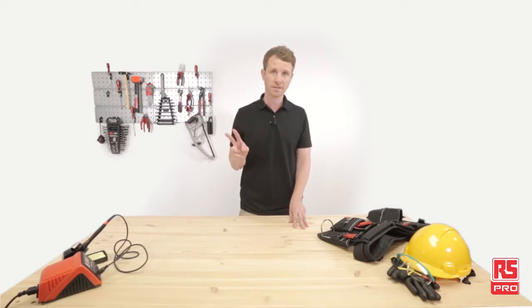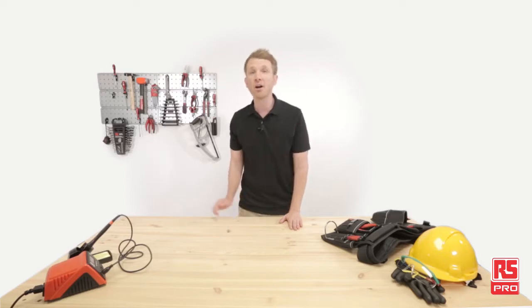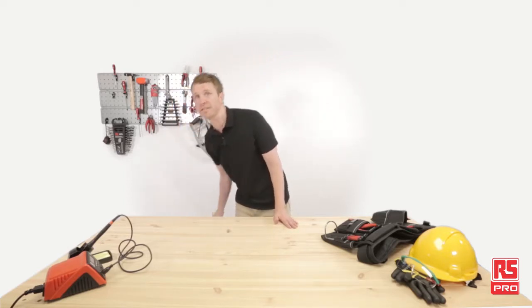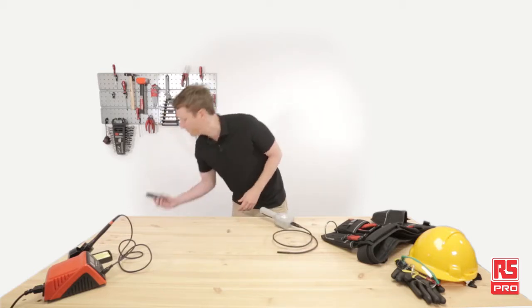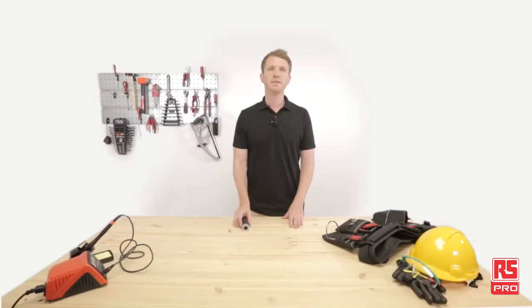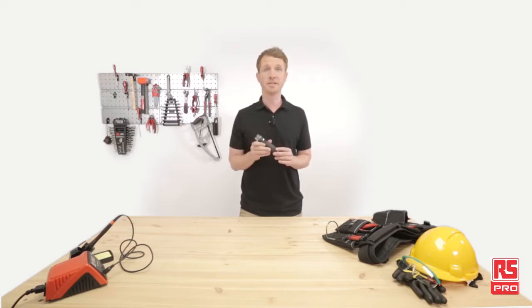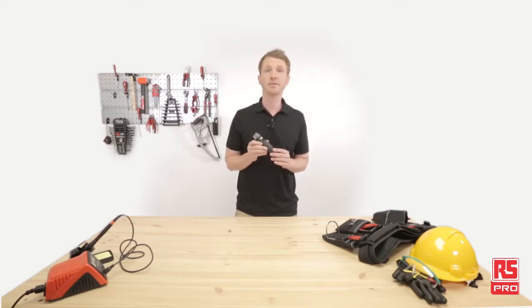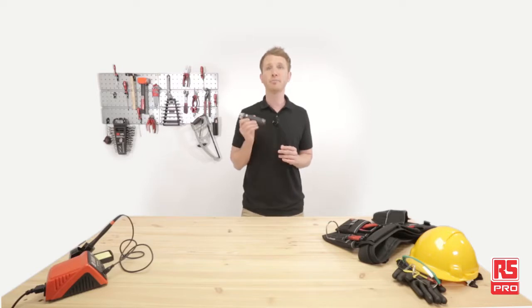Effective maintenance means two things: knowing where we need to operate and knowing how we need to operate. Today we will have a closer look at the RS Pro 8mm video inspection camera and the RS Pro MiFi Wi-Fi microscope. The RS Pro Wi-Fi polarized digital microscope is an innovative handheld digital microscope featuring built-in Wi-Fi transmission. It breaks away from the concept of a traditional microscope, with a wide range of applications from industrial inspection to electronics, medical analysis and printing inspection.